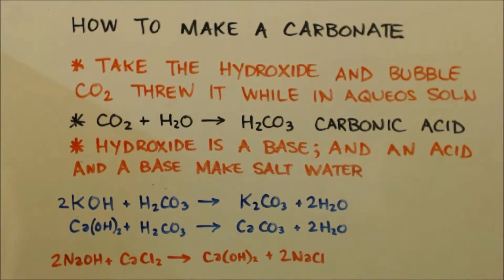Now what I do, because I actually buy potassium hydroxide that's already in water, when I buy it, I put it in a tray and I want to recrystallize it because it's soluble in water. But I don't like to do it fast. I just basically put it in a glass pan and throw it on my radiator, my heater in my house. I have hot water.